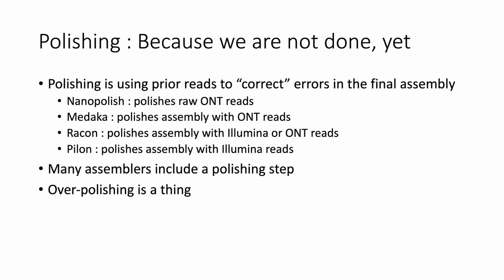Which means that there's no standard polishing procedure. Generally, when people have some sort of assembly, they follow with Racon polishing and Medaka polishing. And they have multiple rounds of those. Many assemblers actually include polishing steps within them.